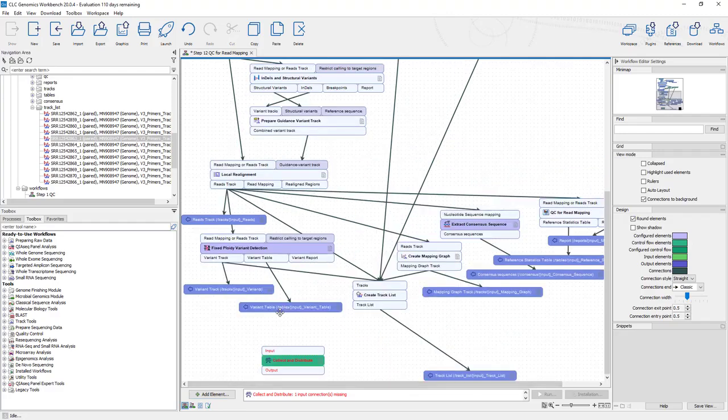And this is how we're going to make our kind of composite view. So in that composite view, let's say we want to have our genome and our primers like before, but say now we'll forget about the mapping. We'll just look at the mapping graph for convenience, and we'll look at the variance.